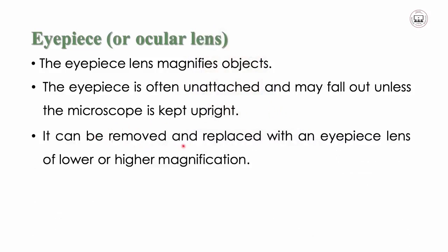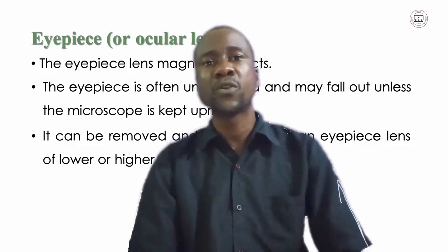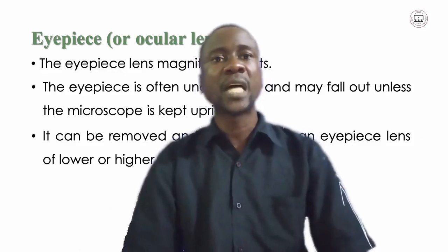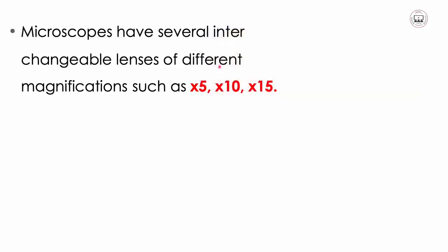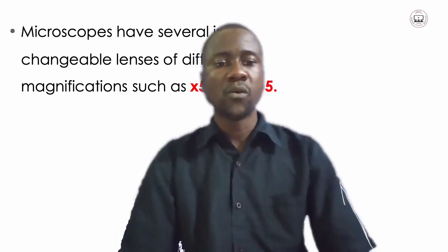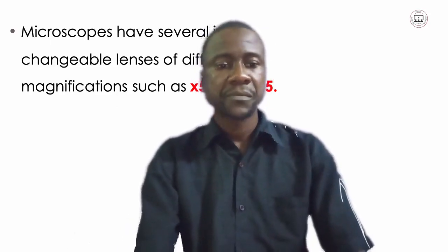Then it can be removed and replaced with an eyepiece lens of lower or higher magnification. That means it is a piece that can be replaced with any type of lens that you wish to use on that particular microscope. Microscopes have several interchangeable lenses of different magnifications, such as times 5, times 10 or times 15. That means those are the sizes of the lenses you may use on the eyepiece.